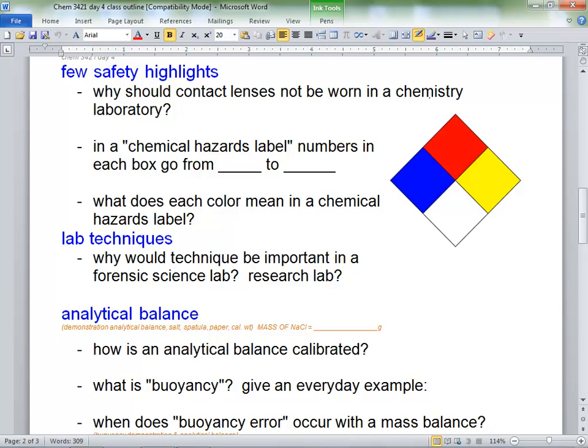And a chemical hazards label. So these things are on the bottles. And I went and I grabbed one from the refrigerator. So it's cold, right? What happens to something that's extremely flammable as it warms up? It's going to expand, right? It really wants to volatilize. So I'm going to build up a lot of pressure in here. Probably set it over here by Jesus and Zach, right? I was thinking, I'll just put it back in the fridge. So I put it back in the fridge.